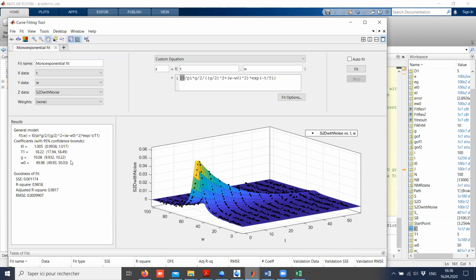where here I have really reduced the number of parameters to the minimum, which is the 4 parameters. And finally, there are ways, so if during your experiments, W0 moves, then it becomes more tricky. This is a single Lorentzian, but if you have a doublet, and the center of your doublet moves over time, and you want to keep J constant for all the spectra, but the center, you keep it free. This is more complicated, but this is also doable. But I don't think I'm going to show that today.